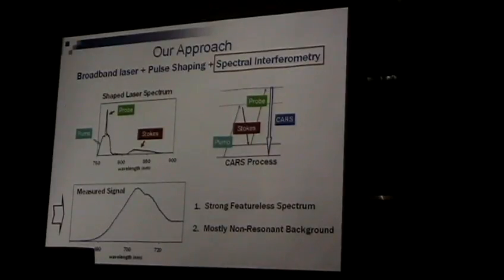If I just think naively, say I need 3 pulses to generate a spectrum, right? Let's say I want this broad part as a pump. And this part, another broad part in red, as Stokes. And I need some narrow but healthy pulse as probe. So say I want to use this part as a probe. I can make this spectral shape using my pulse shaper, right? So remember, my original spectrum doesn't look like this. I process it to make it like this. Alright, I shine it. This is what happened. I know this one is a probe, this one is a pump, this one is Stokes.